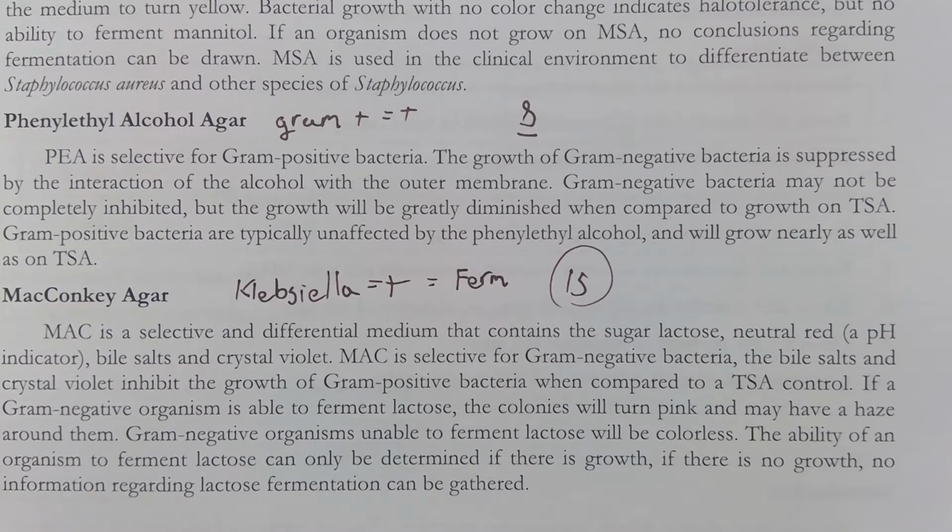Phenylethyl alcohol agar, so PEA, is selective for gram-positive bacteria. The growth of gram-negative bacteria is suppressed by the interaction of alcohol with the outer membrane. Gram-negative bacteria may not be completely inhibited, but the growth will be greatly diminished when compared to growth on TSA. Gram-positive bacteria are typically unaffected by the phenylethyl alcohol and will grow nearly as well as on TSA.